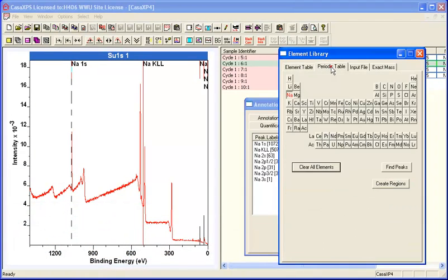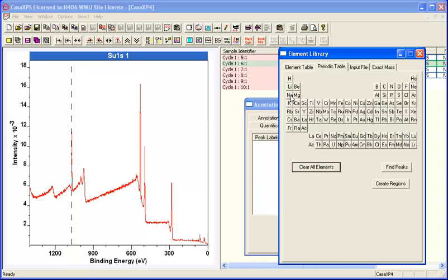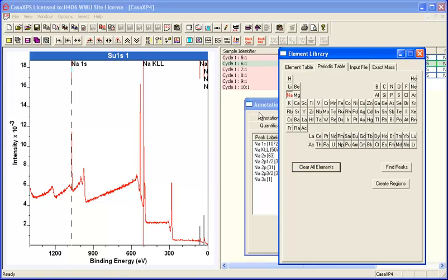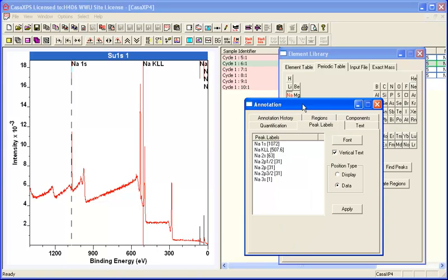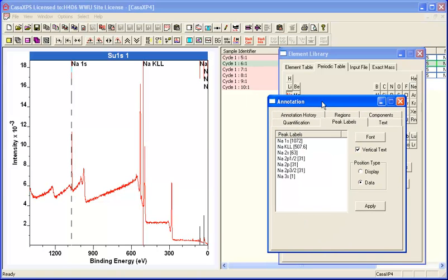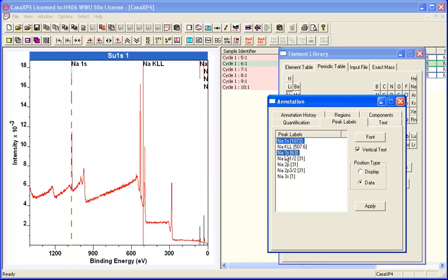There's a list here showing the sodium peaks. This list is showing because I've got the sodium button pressed on the periodic table. If I deselect that, they go away. The idea is that we identify a couple of these peaks. There's sodium 1S and sodium 2S. The sodium 2S is up here, sodium 1S is down here.